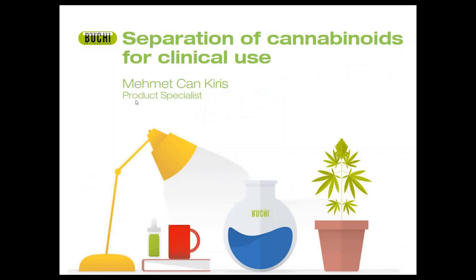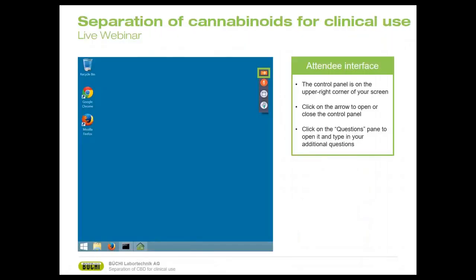Today we will be talking about the separation of cannabinoids for clinical use. It is also called 10 steps to purify CBD oil.